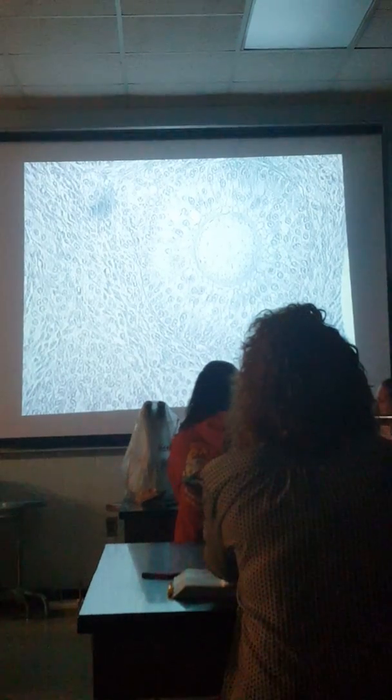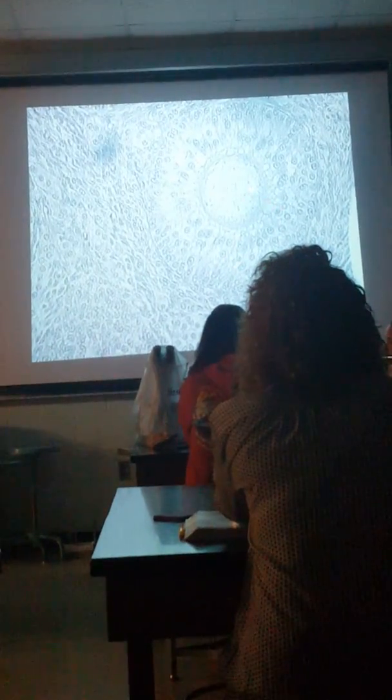So like on this one. This is still a primary follicle, but we just don't see the oocyte. It just didn't happen to get sectioned in this one. This next slide, but see how large they are?